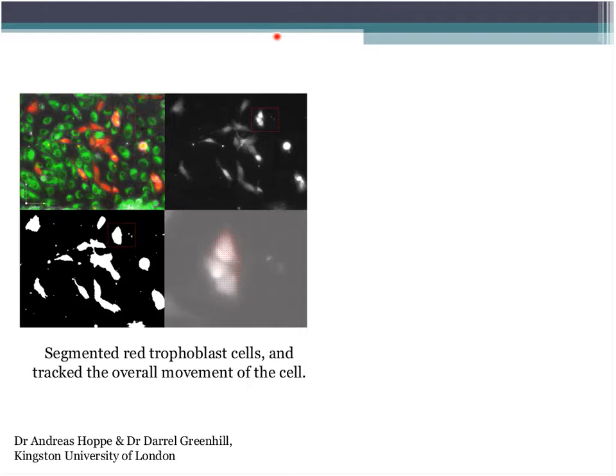And each cell actually produced a distribution of values in terms of its directional migration, because all the vectors in the cell sum together to produce a sort of peak. So it's not just moving in exactly one direction, it's moving over a range of directions, which are usually within a peak curve.